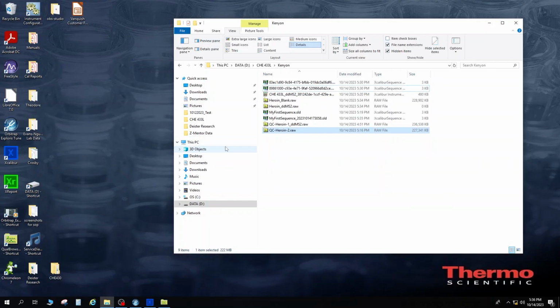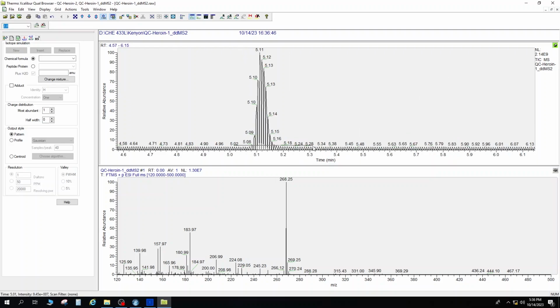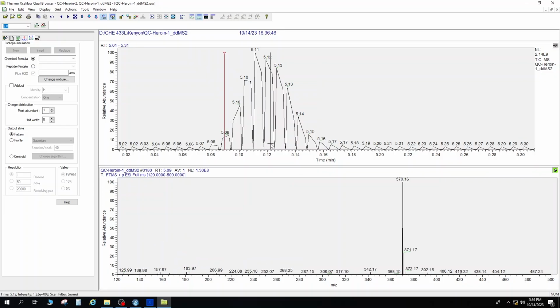So while mass accuracy is quite powerful and is going to generally get us our chemical formula, if we truly want category A data, we need to get MSMS data. So I've opened up this file that has what's called a data dependent scan, and this has MS data, mass spectra, or MS1 data, and MS-MS data within that data.